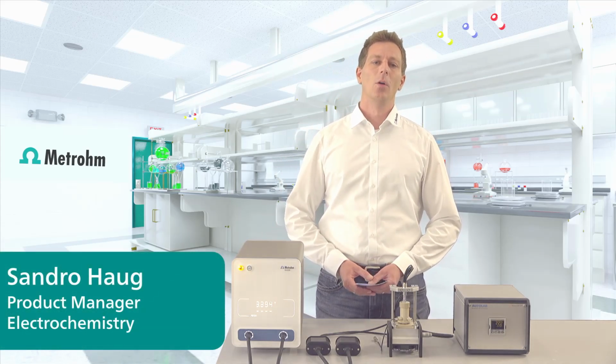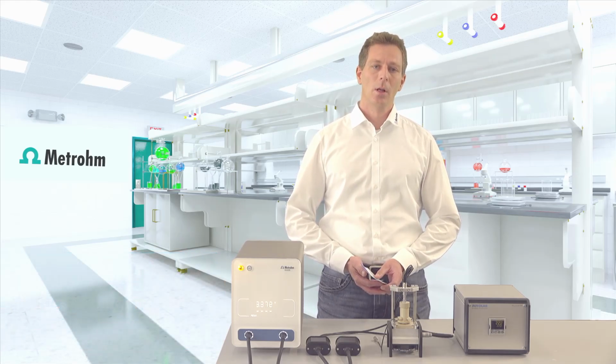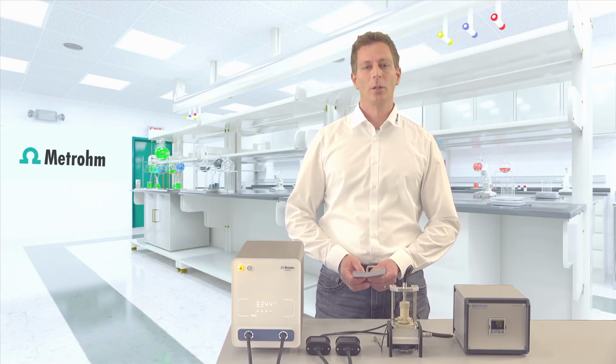My name is Sandro Haug, and in this video I will talk about electrochemical impedance measurements on lithium-ion batteries and the related important practical issues which have to be considered. Let's have a look at the topics of this video.